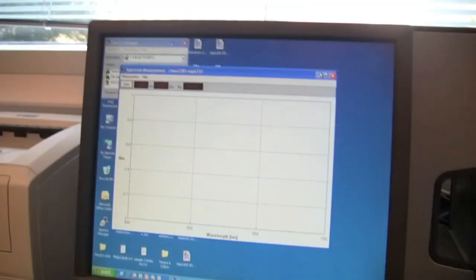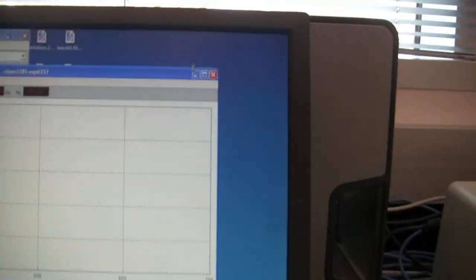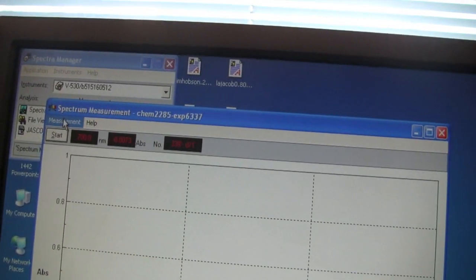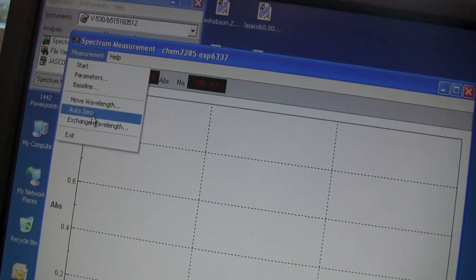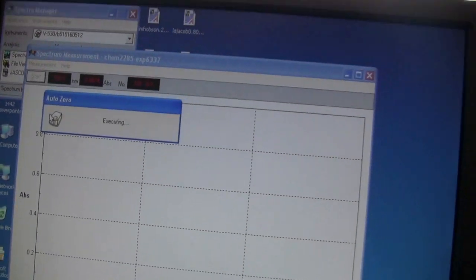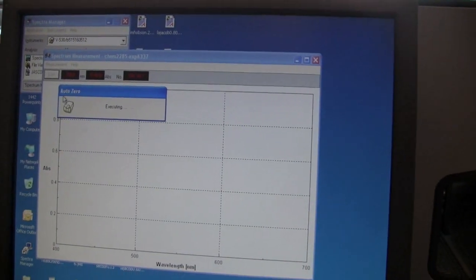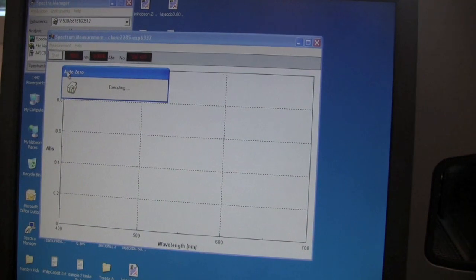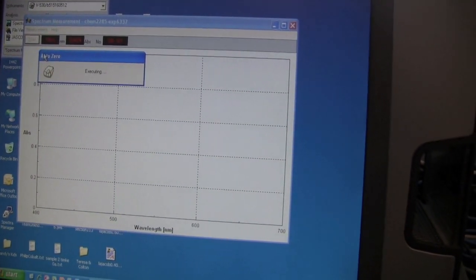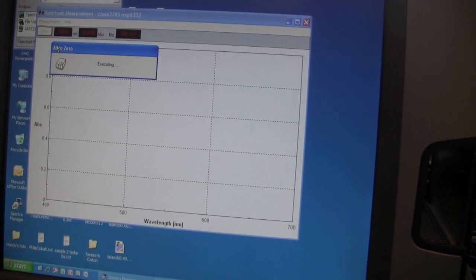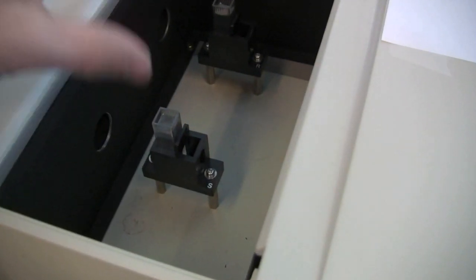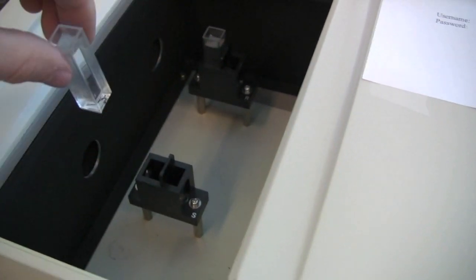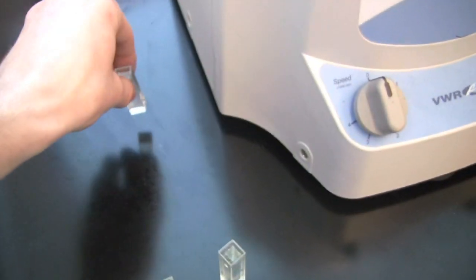Close the lid and go to the spectro management program. Click the management tab and click auto zero. The computer will begin calibrating the spectrophotometer. Once it's calibrated, remove the cuvette with the deionized water closest to you and place this separate from the rest of the cuvettes.